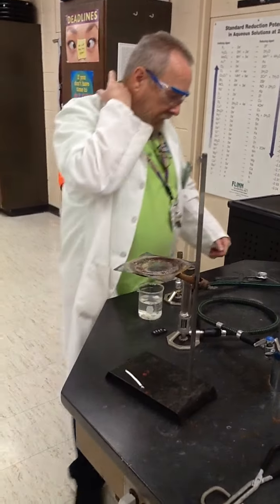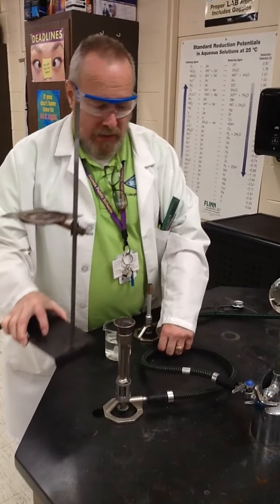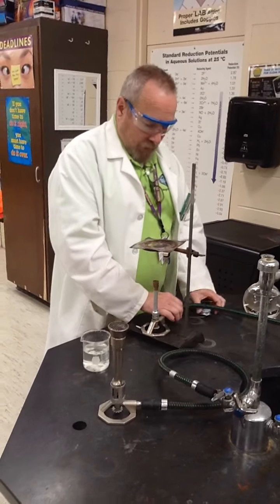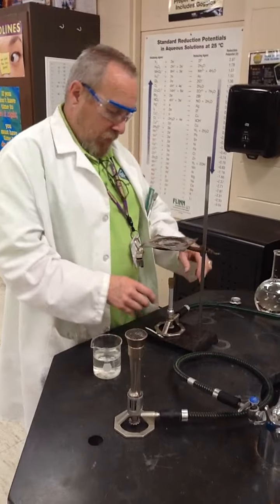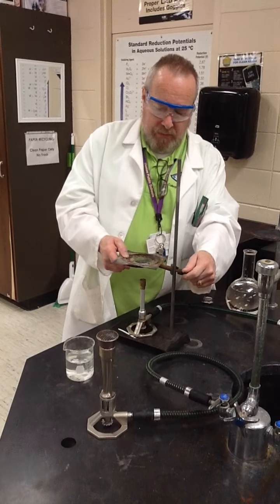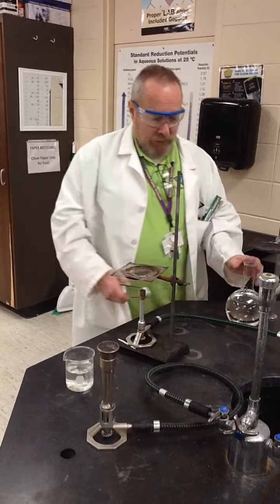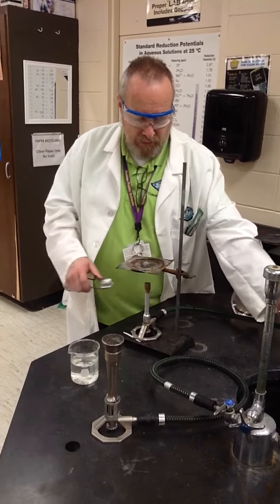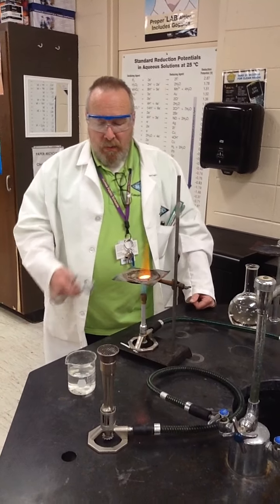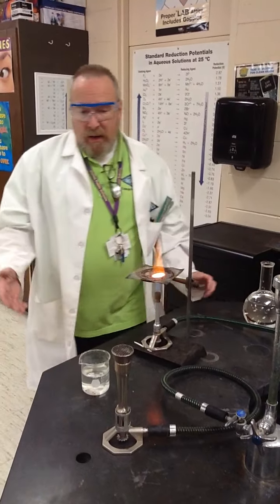And what I'll do is move my burner under my ring stand, give myself between 5 and 10 centimeters of distance. That's a little high. Let me get it back down in the 5 range. And I'm going to light my burner. And you'll see the wire quickly heat up to red hot. And I have a flame.